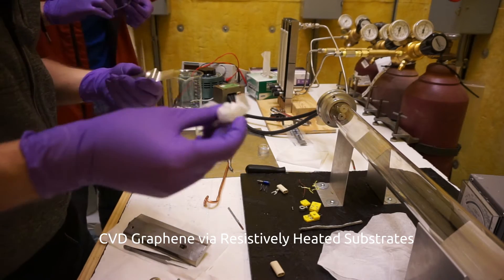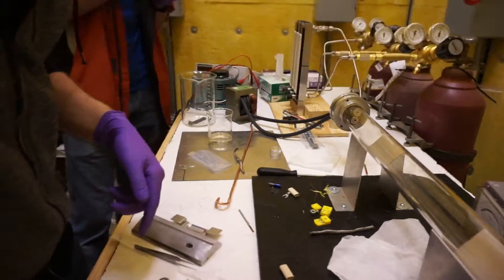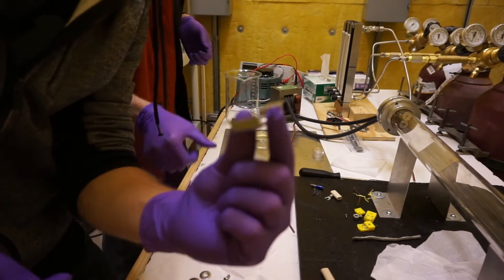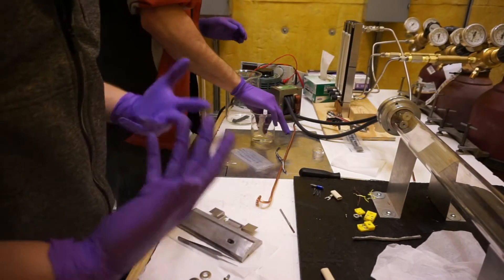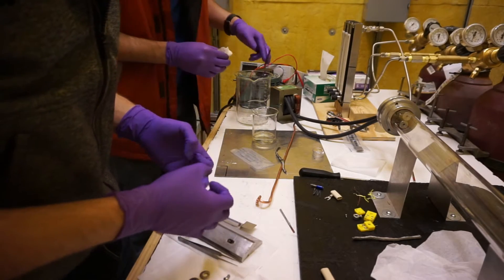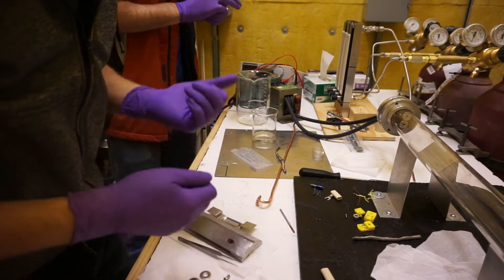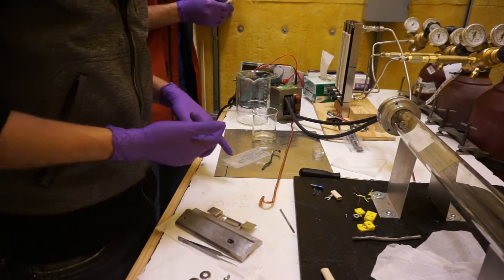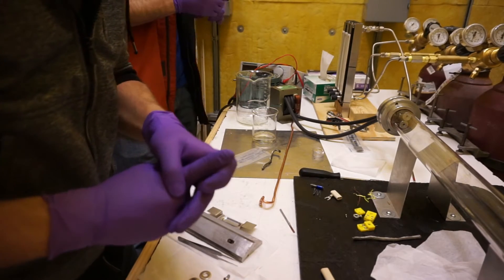The title of our grant was 'CVD graphene via resistively heated substrates.' We have these big steel heat sink plates that go into the vacuum CVD chamber. They hold onto a tungsten boat, which has greater resistance than the rest of the circuit, so it gets the most power delivered to it and gets very, very hot. We put our copper foil inside the hot tungsten boat - the copper is what the graphene grows on. The heat catalyzes the breakdown of the gas and allows carbon atoms to deposit onto the copper surface. Vacuum is used so we have a pure environment and can control what gases are in the chamber. We'll have methane as the carbon source.